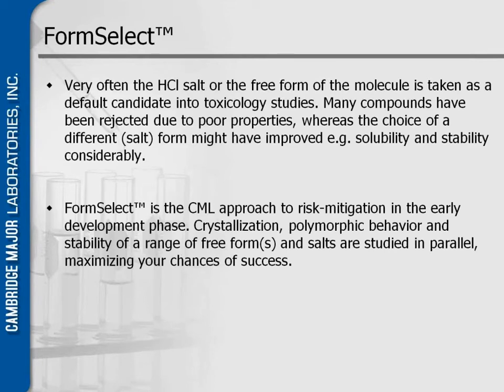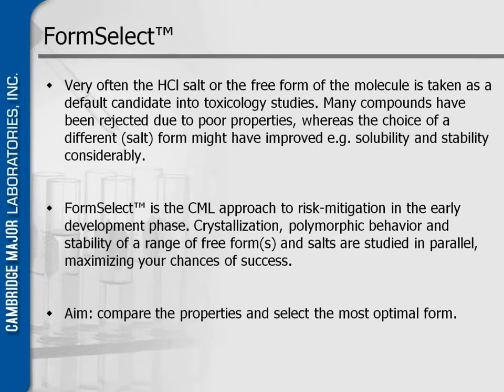When you look at the earliest possible development phase of this form, you can have an effect on the crystallization and see which forms or salts can be selected to study in parallel, and then make a selection, because the aim is to compare these properties and select the most optimal form. The process is already fixed. Details are there if you make a salt out of it or you have a recrystallization going on.